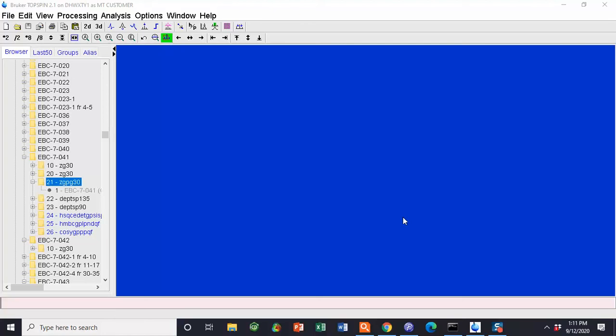How to print and peak pick a carbon NMR spectra for the Donahue Research Group and the PIGSA Research Group. When you go to Topspin and open up the appropriate notebook numbers folder, you will see that once characterized, you will have a list of possible choices. The carbon NMR spectra are in this case 21, 22, and 23.